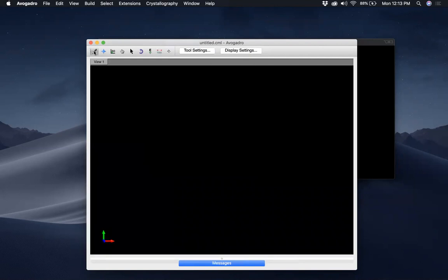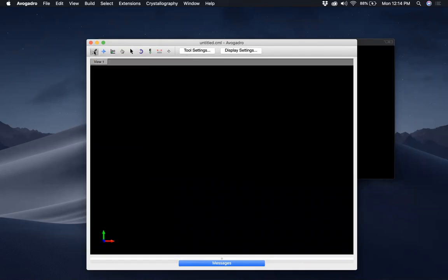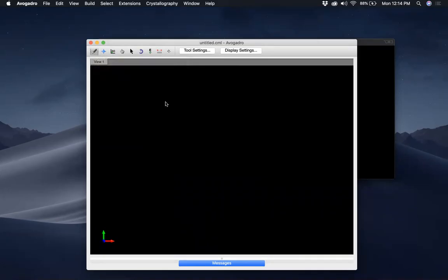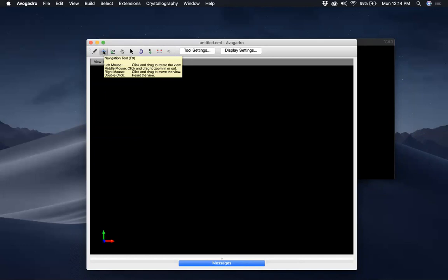It shows 'Draw Tool' and the keyboard shortcut is F8, and it tells you how to use it. With the left mouse button you click and drag to create atoms and bonds; if you need to delete, you use the right mouse button. On a laptop you just click once and it will draw something. This is the Navigation Tool and the instructions are shown here.